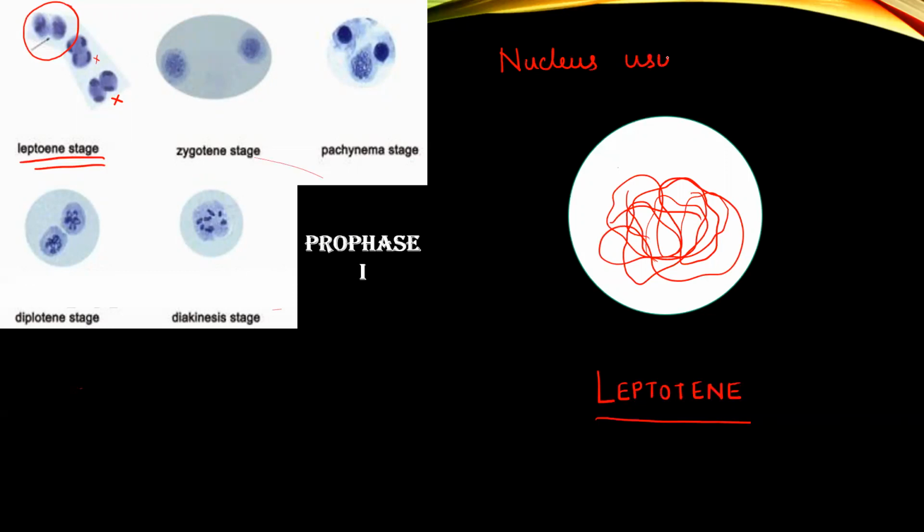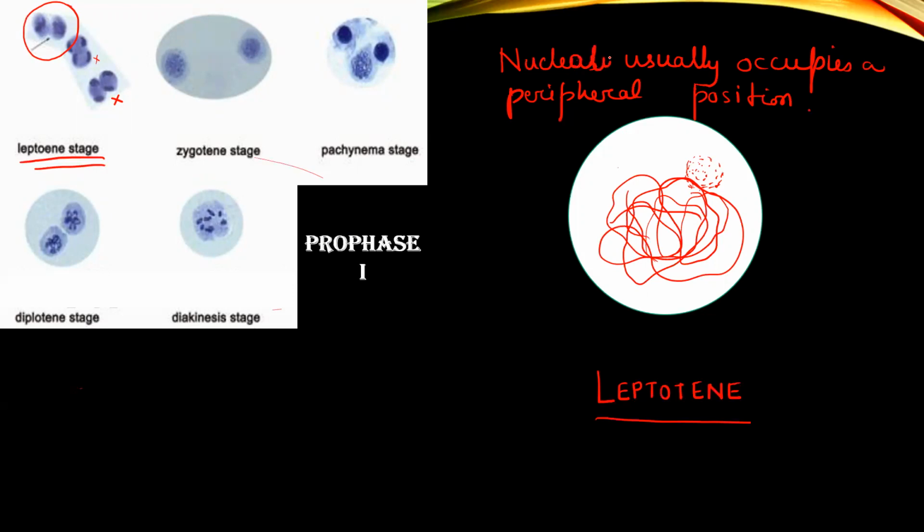The nucleolus usually occupies a peripheral position.